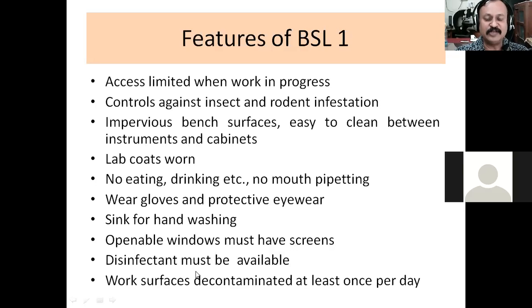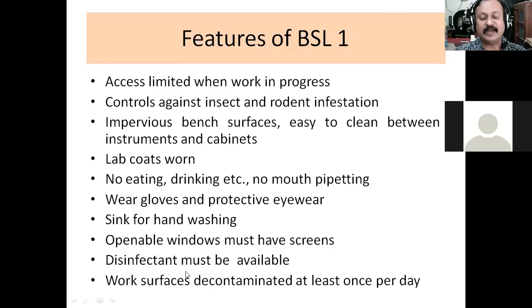And then there should be disinfectant availability. Again, you might have experienced that in your laboratory. You might have been using Dettol or any such disinfectant. Have you used a disinfectant? Yes, sir. That also is very important because that will be used to clean your work surfaces, and it can also be used to clean certain materials.